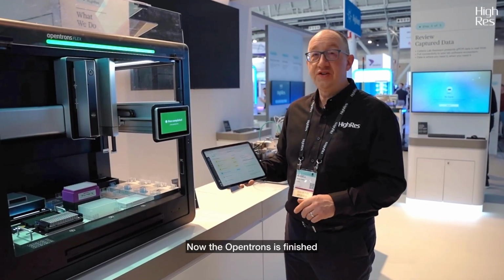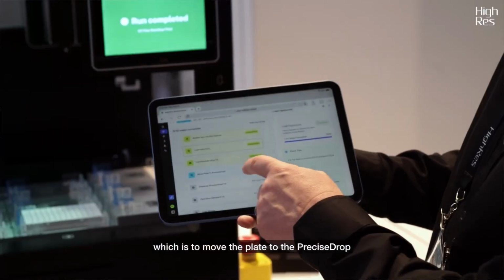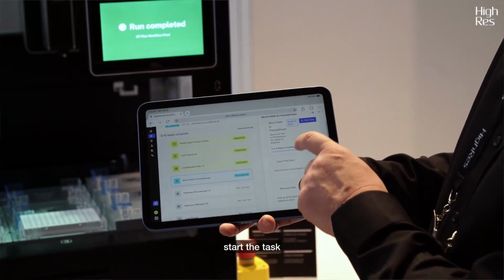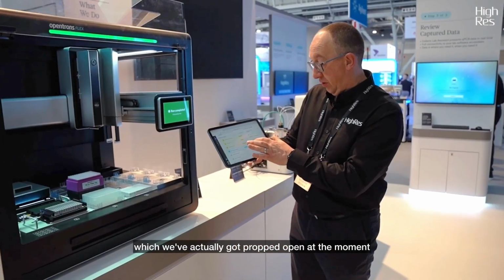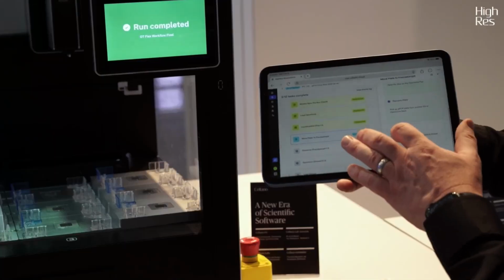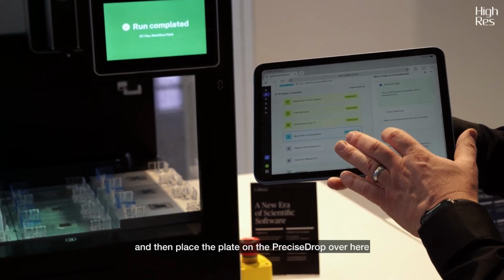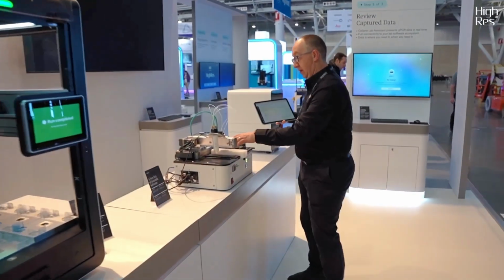Now the OpenTrons is finished, we can move on to the next guided task, which is to move the plate to the Precise Drop. So I can move on to that, start the task. It's asking me to open the door of the Flex, which we've actually got propped open at the moment, retrieve the plate, close the door, and then place the plate on the Precise Drop over here.